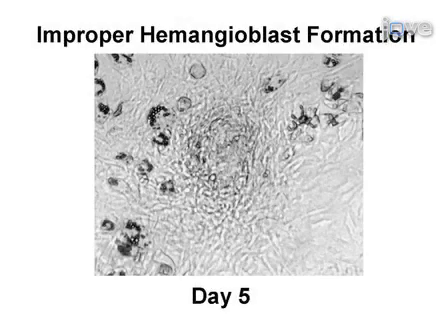In contrast, a co-culture with improper ES cell differentiation will result in ES-derived progeny that do not appear in a whorl pattern at day 5. The absence of cells in a whorl pattern indicates improper hemangioblast formation. A co-culture with improper hemangioblast formation will ultimately result in stunted hematopoietic lineage differentiation and should be discarded.